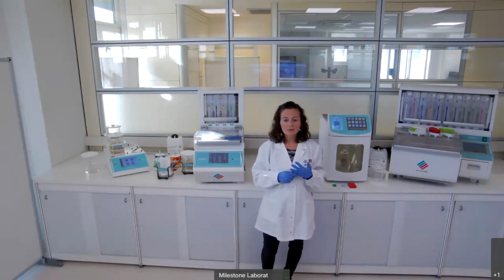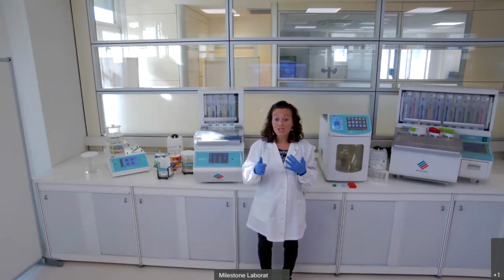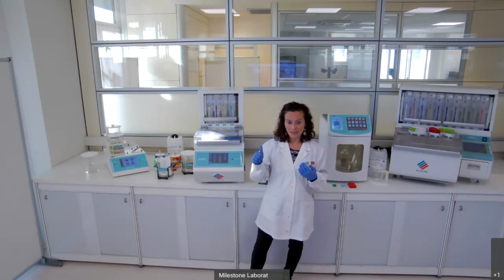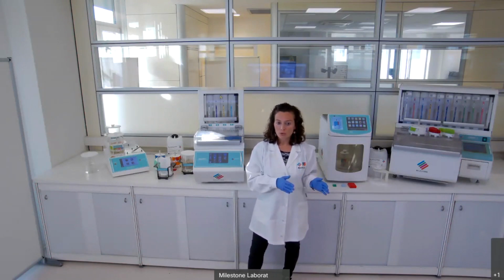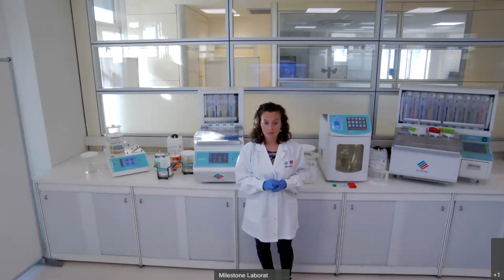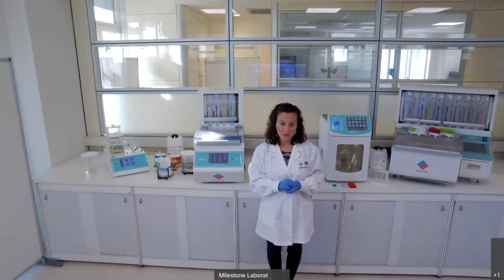Agitation. It seems to be very, very simple, but it's important to maintain reagent homogeneity and always fresh solution close to the bone. Then, standardization and documentation. They are 2 key factors to document your process to be able to report the decalcification activity. Now, with this, I conclude my explanation.